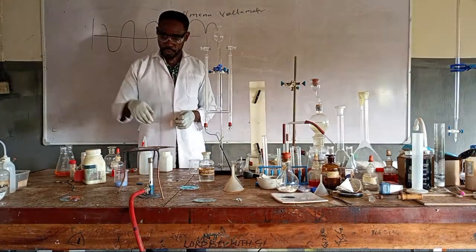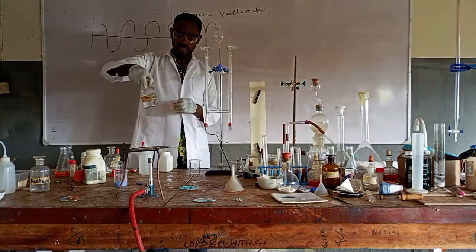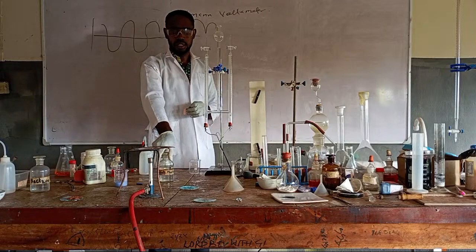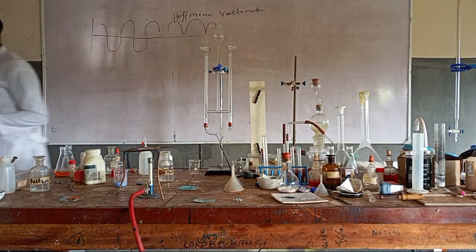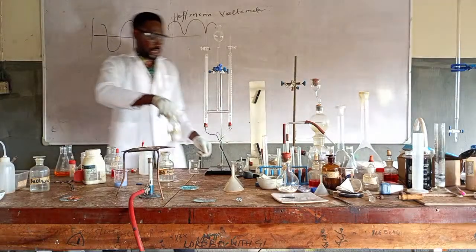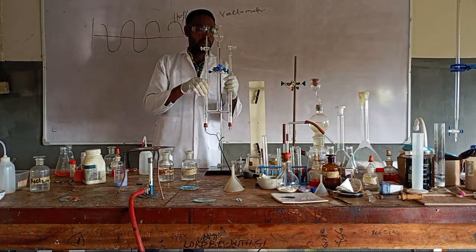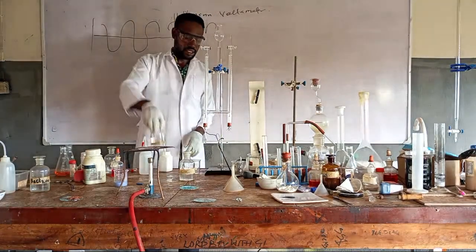Water. For example, over here we have, okay, we don't have any labeled base here. This is dilute what? HCl. It's not dilute. Dilute hydrochloric what? Acid. Let me get a base. Okay. This is a base, right? And this is an acid.